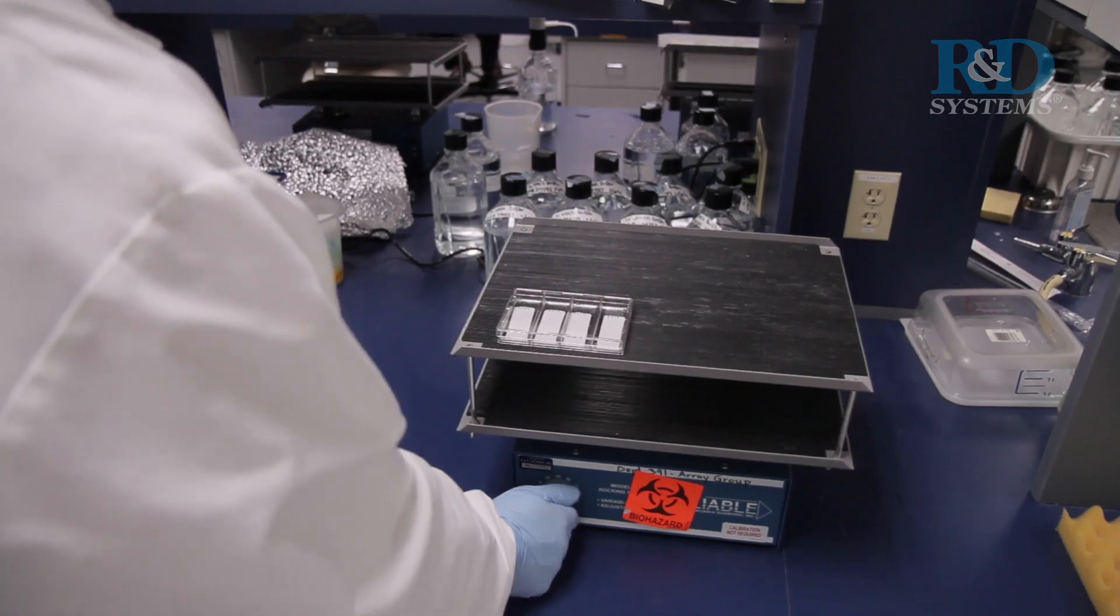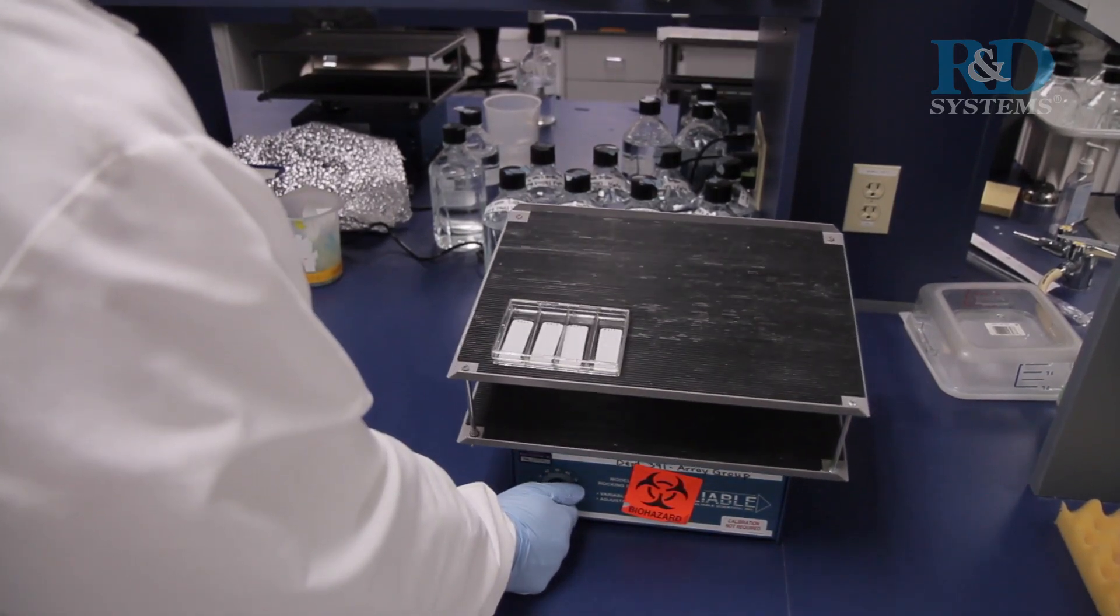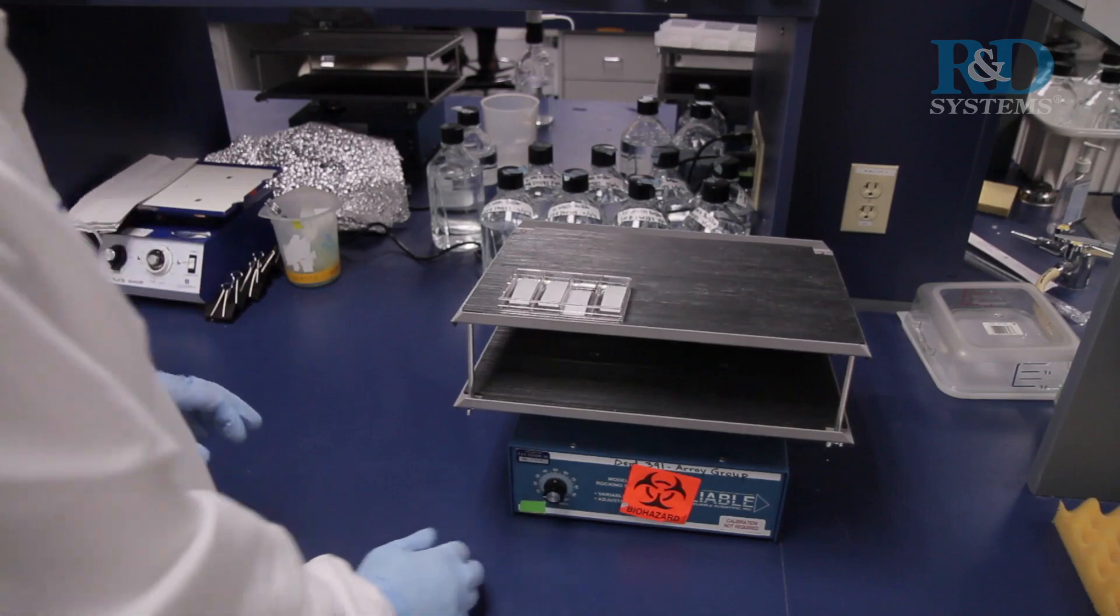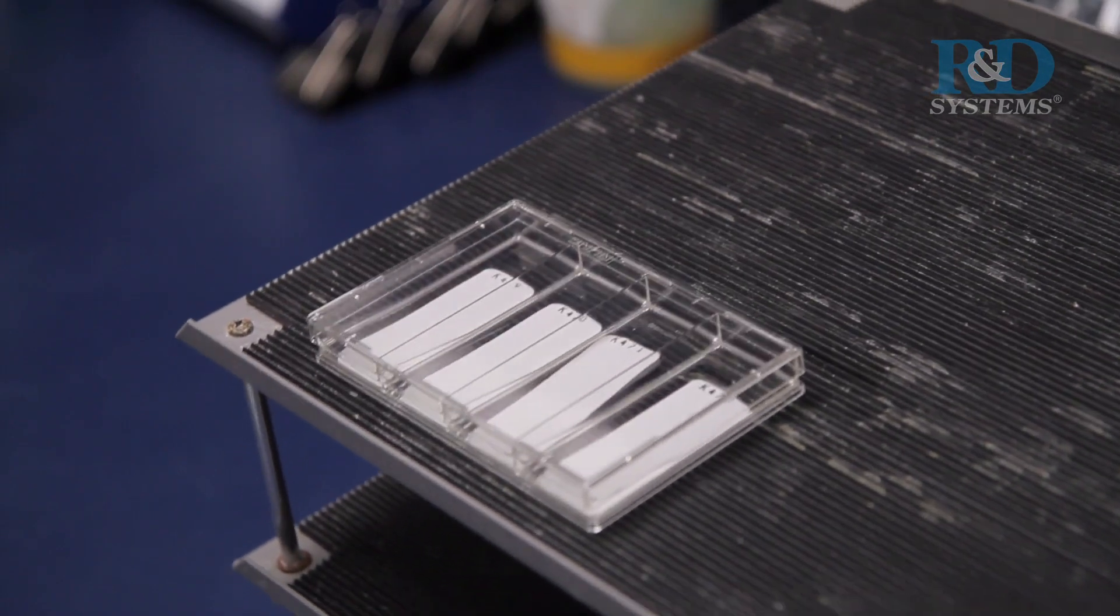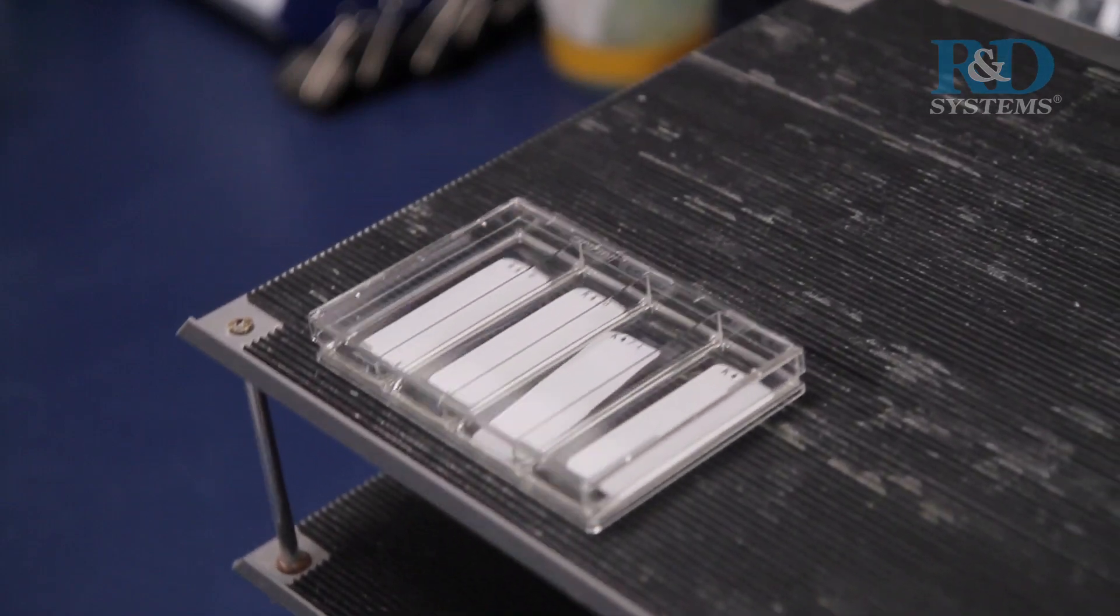Cover the wells with the lid and incubate for 2 hours at room temperature on a rocking platform. The surface of the array should be completely covered by diluted antiphosphotyrosine HRP.